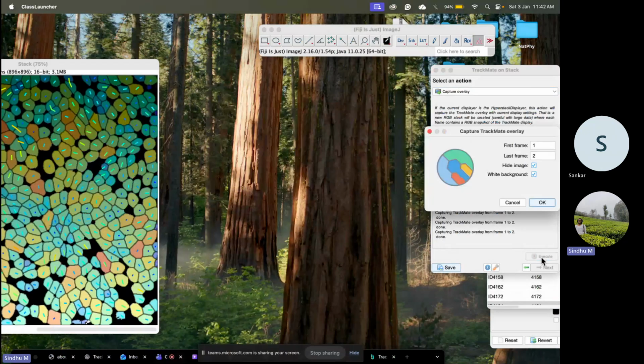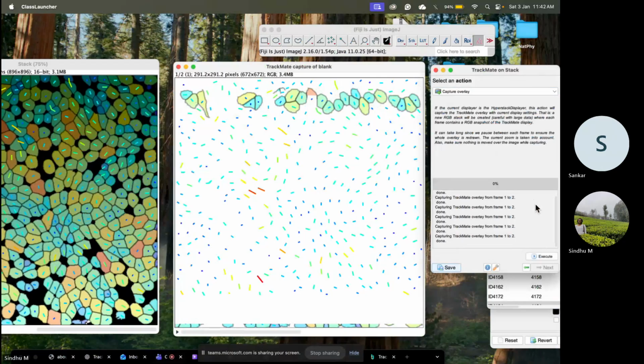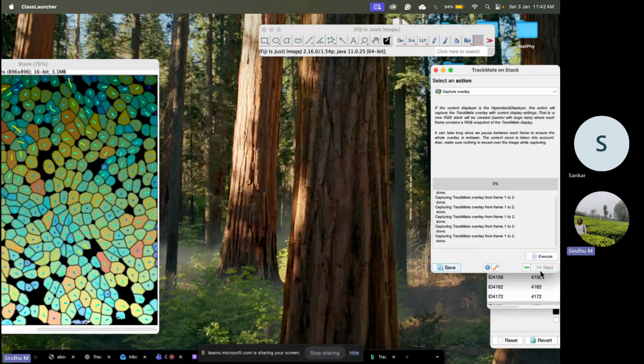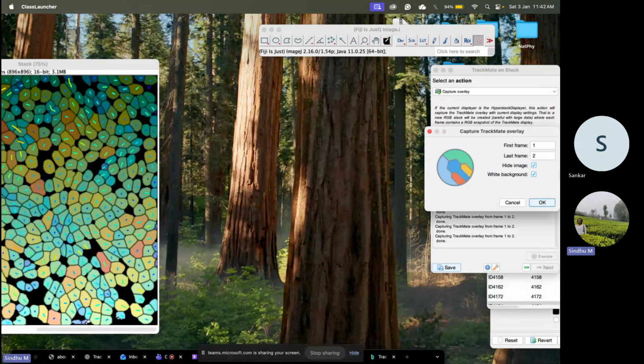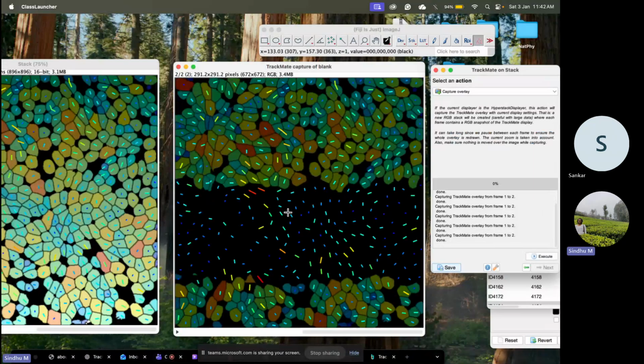Yeah, let's just... This is worse. Let's try now. Yeah, it's not working at the moment.